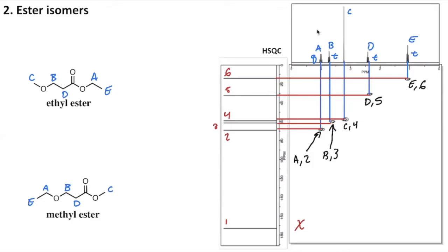I'm going to take a minute to quickly draw in our numbers for the carbon and re-letter our letters for the hydrogens so that we have a very clear picture of what is going on where. So we said that the hydrogens E are on carbon 6, so I'm going to label this carbon number 6, and I'm going to try to do this as neatly as possible, and then alter the hydrogen annotations so that they're a little bit cleaner.